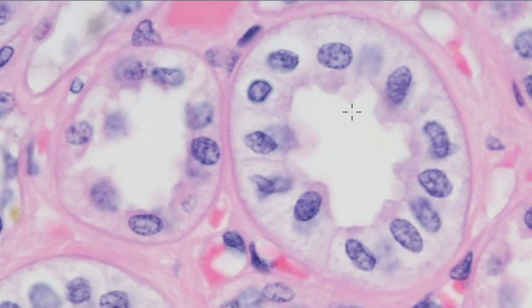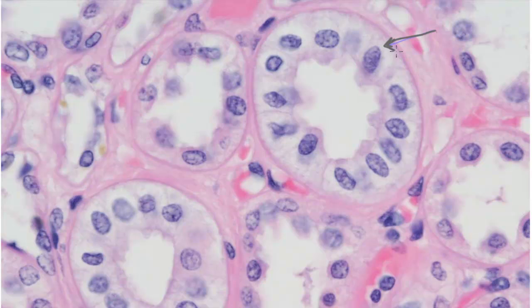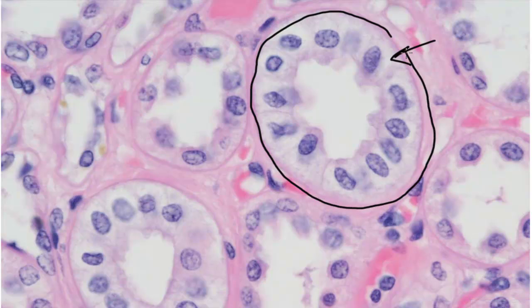All right. So, let's move on and look at another sample. This is also taken from the kidney. And here, our epithelial cells are found right in here. So, let's look at this cell right here. And what I want you to notice is this cell. And so, I'm going to outline the entire epithelium.